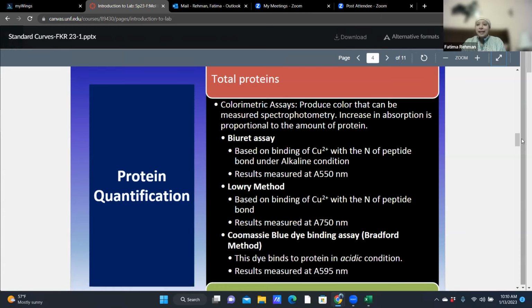So at 280 nanometer, you can detect amino acid content in your sample. It could be a complex sample with lipids in it, or it could be just a pure protein sample. But yes, you can utilize that information. Now, the issue with that is that it's a very small wavelength, right? And so that means that our plate reader has to be able to detect it, which not most plate readers can do. They'll be more expensive and not available worldwide to all the researchers.